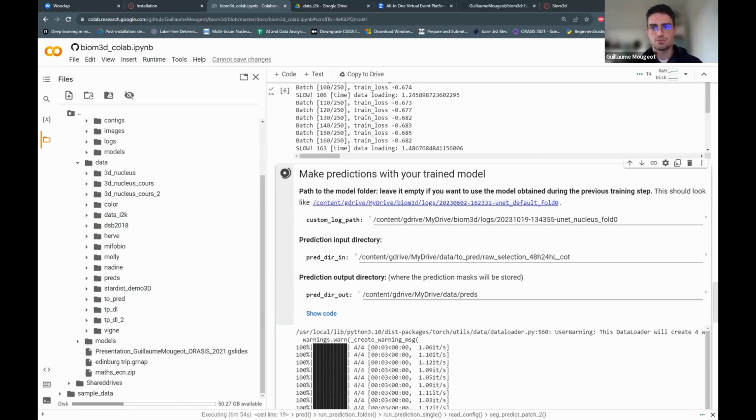And just to be sure, in your small volume, you have to annotate everything. If some of the regions must be ignored, just don't annotate them. But be sure to annotate every region that must be labeled, and not say, okay, I'm just annotating the middle of my image. Better to crop the image. That's another reason why it's good practice to train on small volume and then predict on big one, because you can segment everything in the small volume and then predict on the big one. So it's a very interesting question.